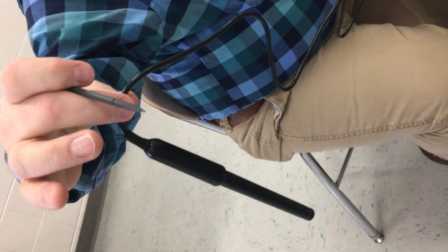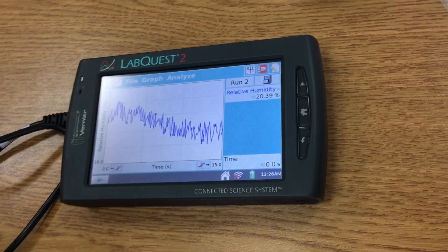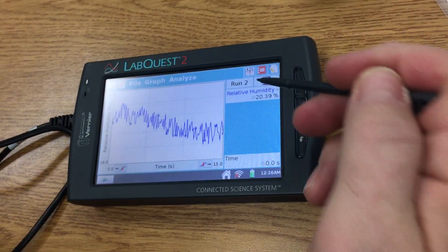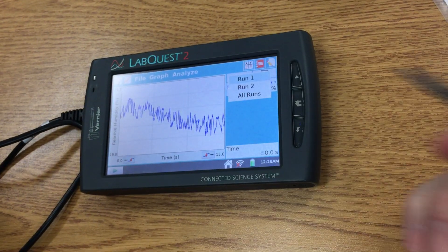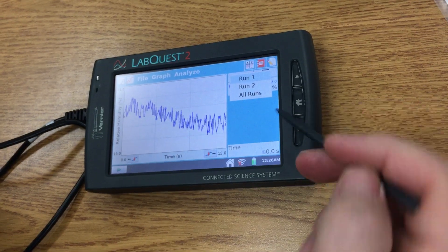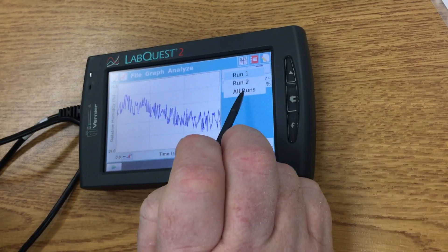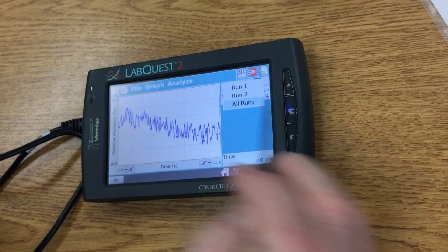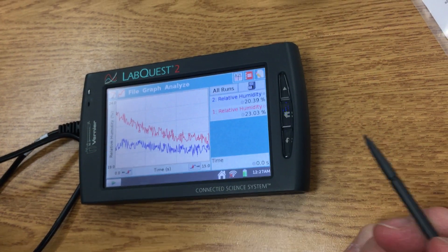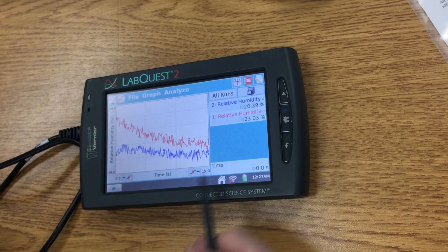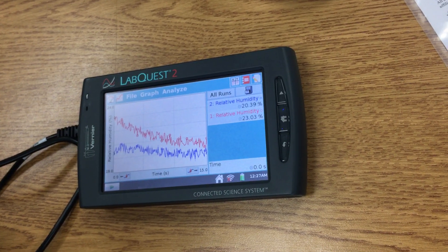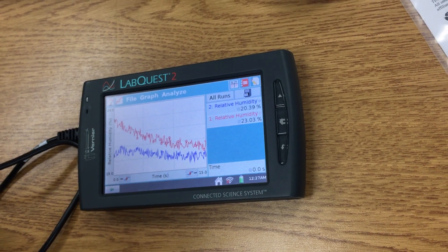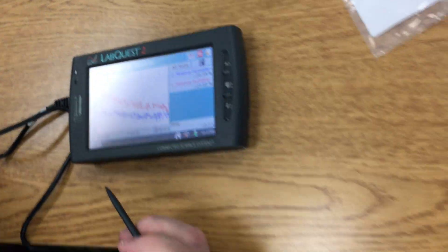There you go, I think it's done. So now we have two runs: run one and run two. Notice it says All Runs. If I click on All Runs, this is the screen that I get. All right, now your job is to test it out.